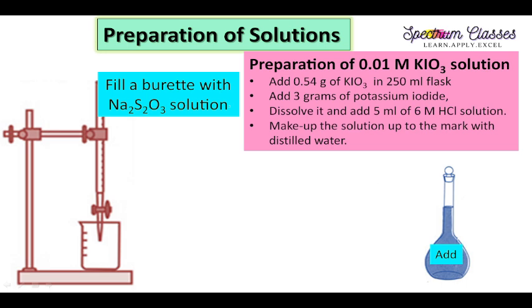Fine. And similarly, you can prepare the solution of your sodium thiosulfate. Take some amount of sodium thiosulfate, dissolve it in the desired volume thoroughly with deionized water, and fill that solution into your burette. This is the sodium thiosulfate of known concentration.